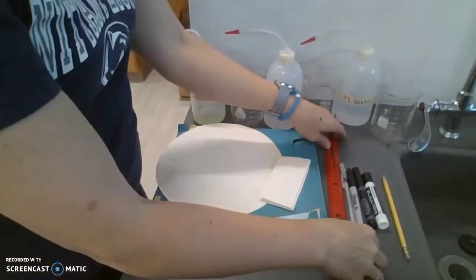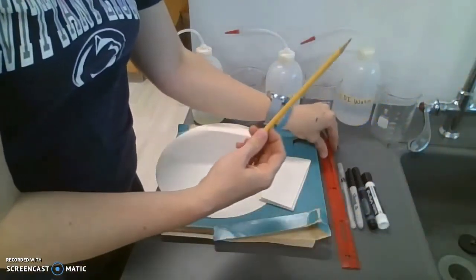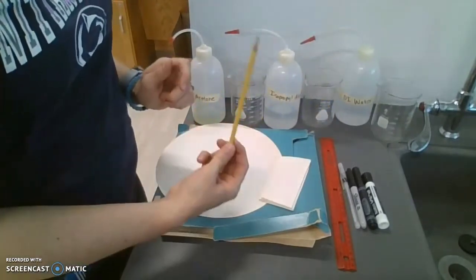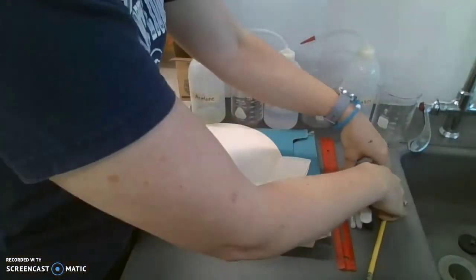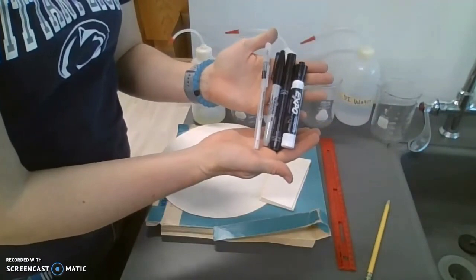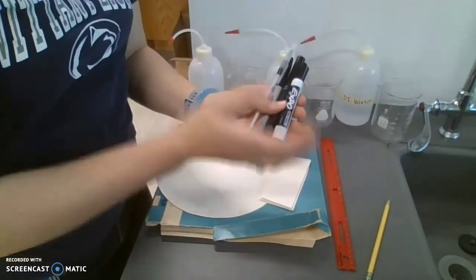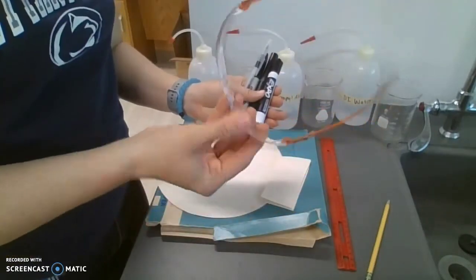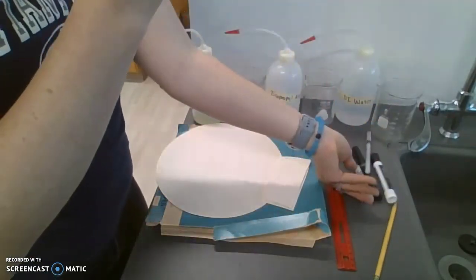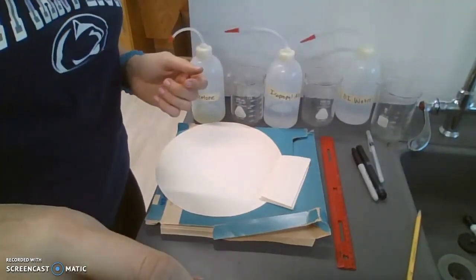And then we have a ruler, a pencil to mark where everything started and stopped, because pencils are not soluble in any of these. And then some ink in order to test. I chose the color black because I like to see the differences in the black pigments. And as always, you need some goggles because even these solvents are going to possibly hurt your eyes if they're splashed in there.